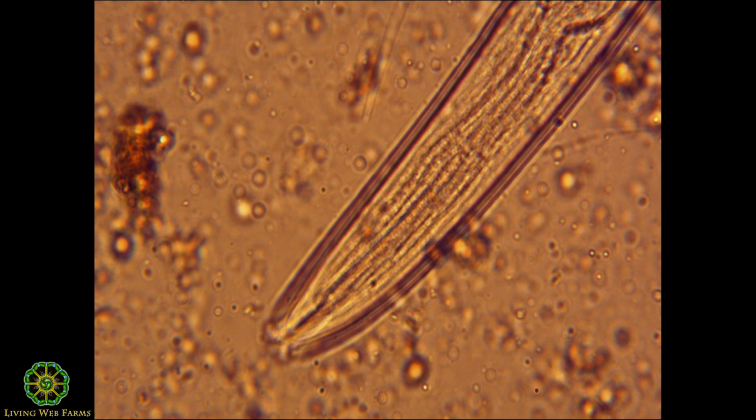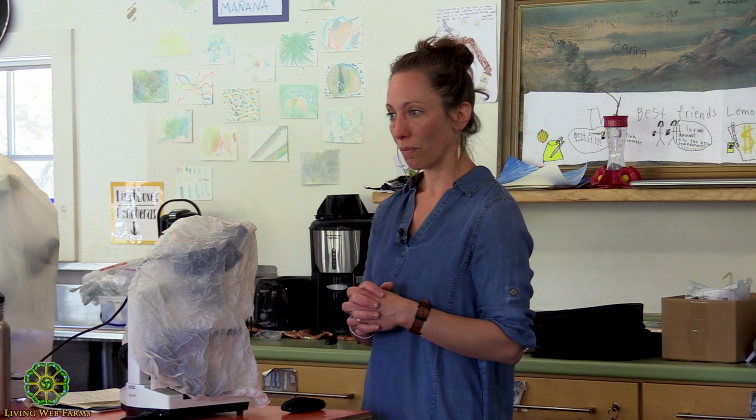Here's an example of a bacterial feeder. I always get excited finding bacterial feeders in agricultural soils because I just want to find things to keep bacteria in check. I want to see higher taxonomic groups. I get excited when I see fungi. I get excited when I see bacterial feeding nematodes. I'm working on completely undisturbed compost right now, which may show me some higher fungal feeding nematodes and some predatory nematodes and things like that.